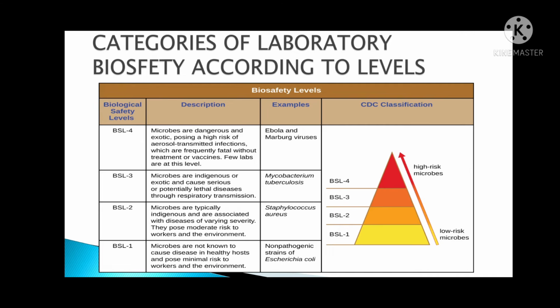A BSL-4 laboratory is generally a separate building or completely isolated zone with specialized ventilation requirements and waste management systems. Laboratory staff must have specific and thorough training in handling extremely hazardous infectious agents. The laboratory is controlled by the laboratory supervisor in accordance with institutional policies.